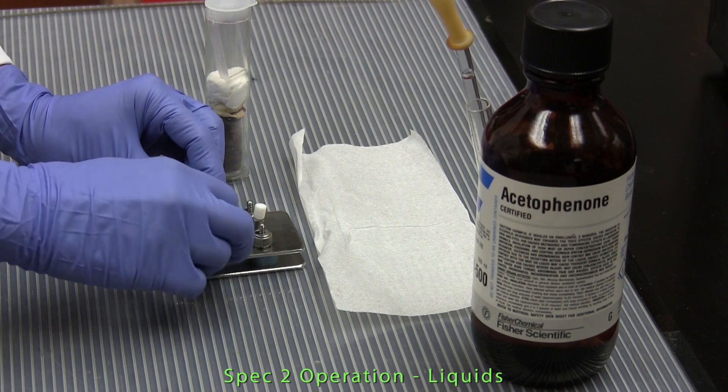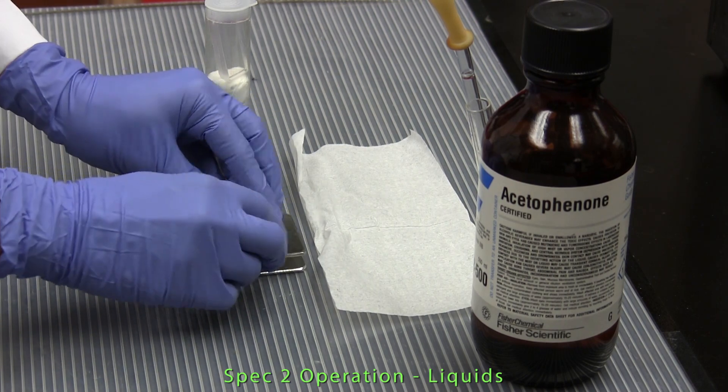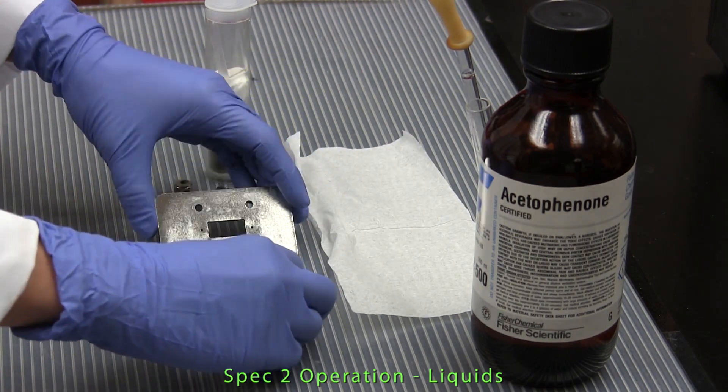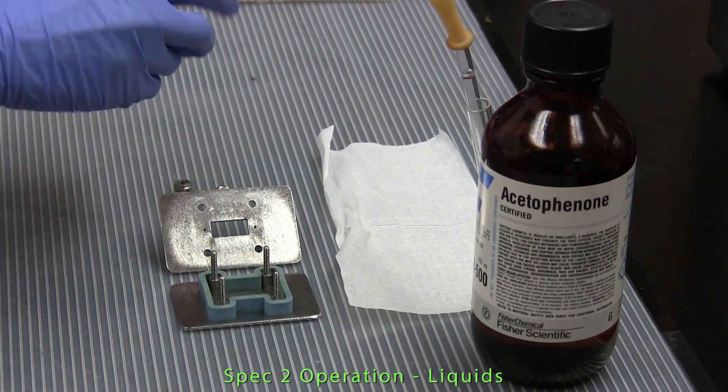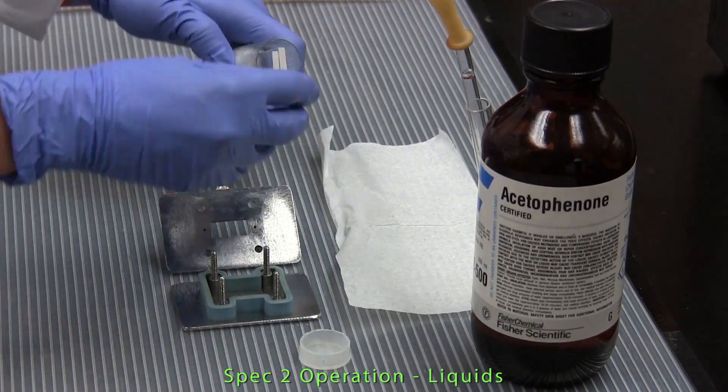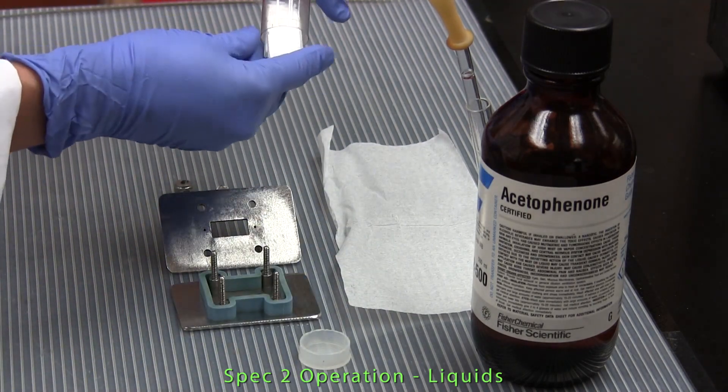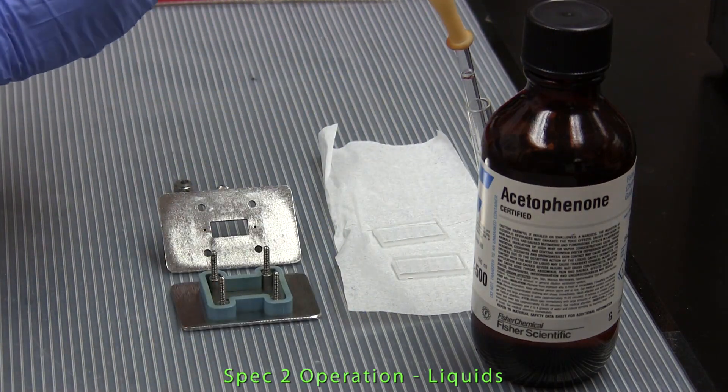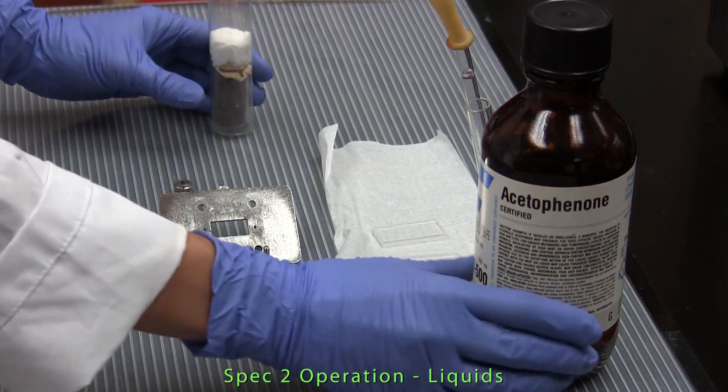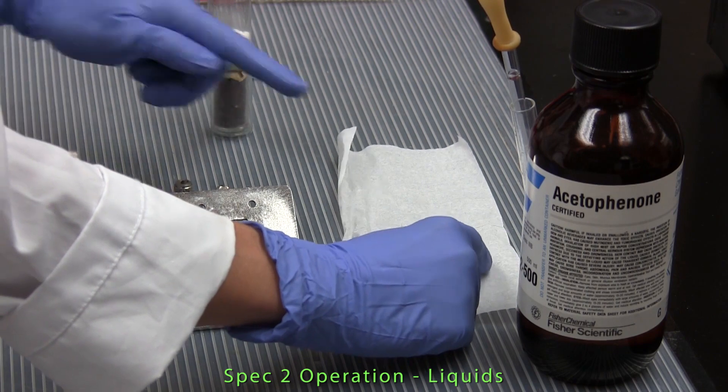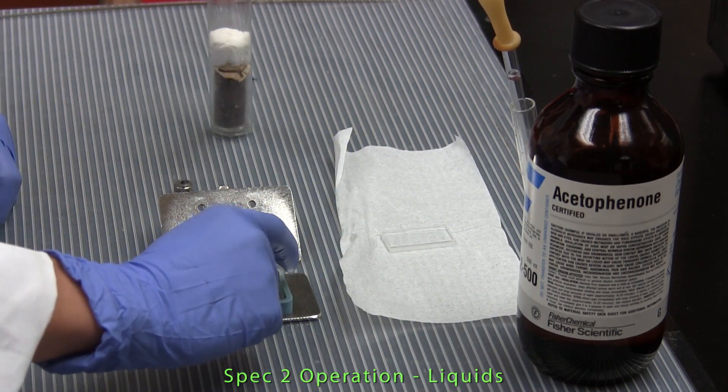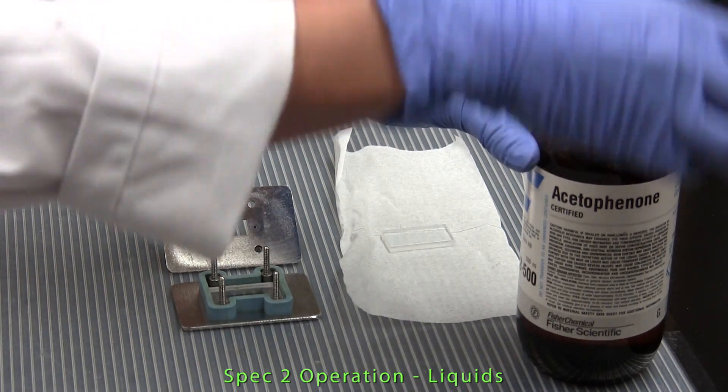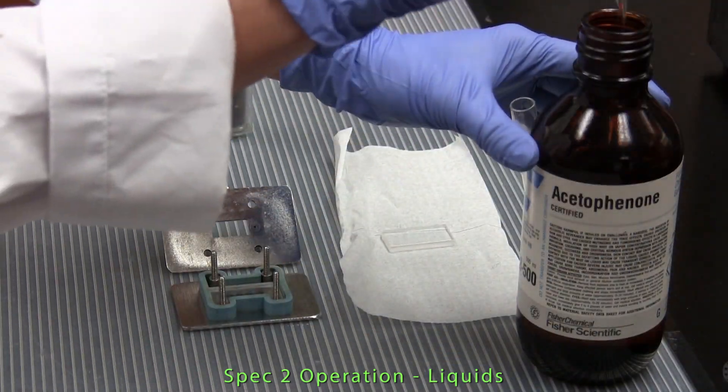We use a demountable cell and a set of polished sodium chloride plates. The cell is disassembled and the sodium chloride plates are removed from their container, handling carefully only by the outer edges. One plate is placed inside the cell and a drop of liquid is placed in the center of the plate.